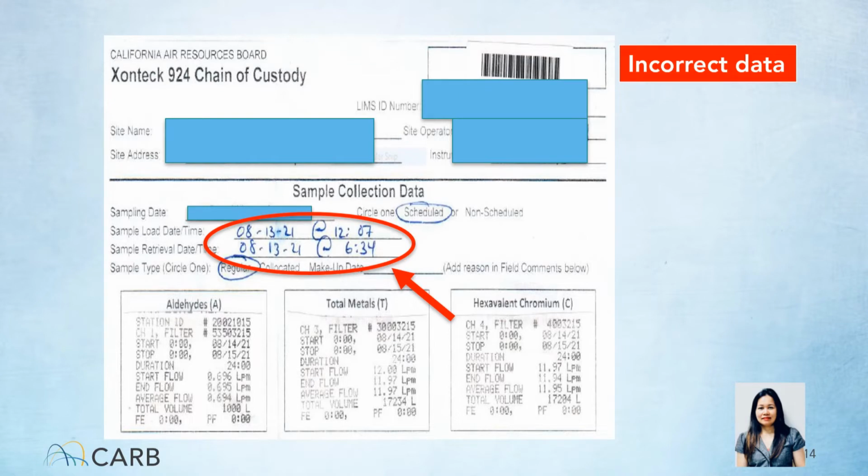Aside from processing, logging, peer reviewing the samples, and other tasks, this is the most time-consuming issue the sample handling staff face almost every day. We send out follow-up emails to the site operators so they can revise or update errors on the COCs. It would be very helpful if COCs could be checked for errors prior to sending them back to the lab.